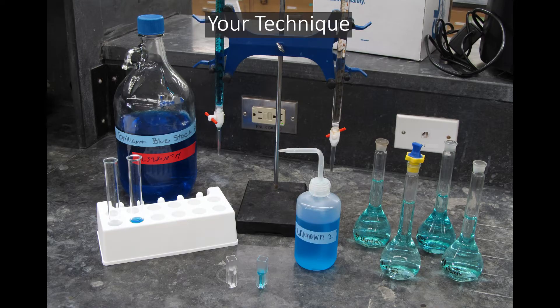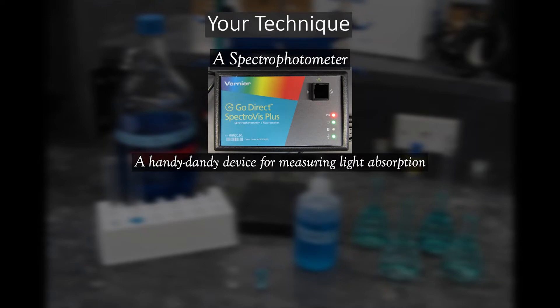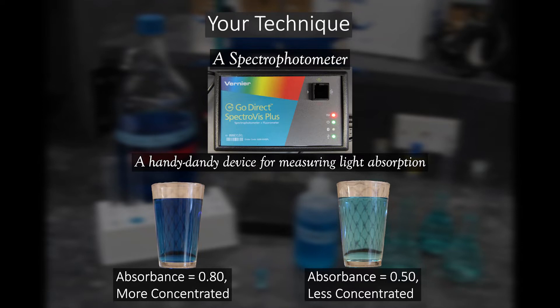The technique you're going to use relies on this same concept, but it takes it a step further. Instead of just looking at a solution with your eyes, you'll use one of these here devices, a spectrophotometer, to measure its absorbance, which is a number that tells us how much light the solution absorbs.